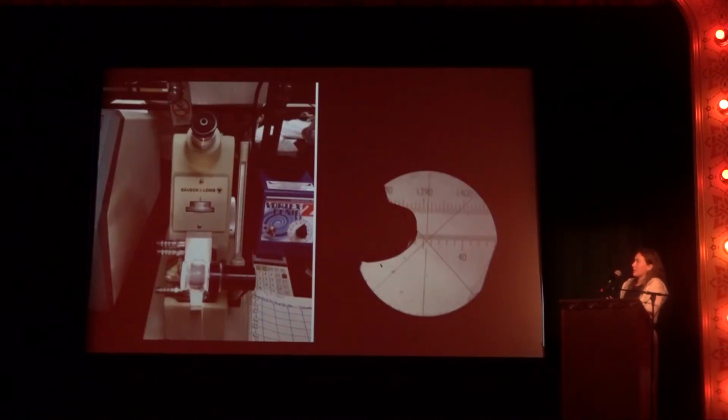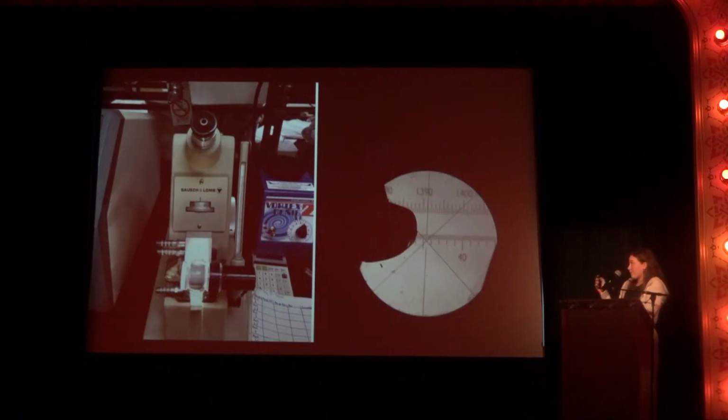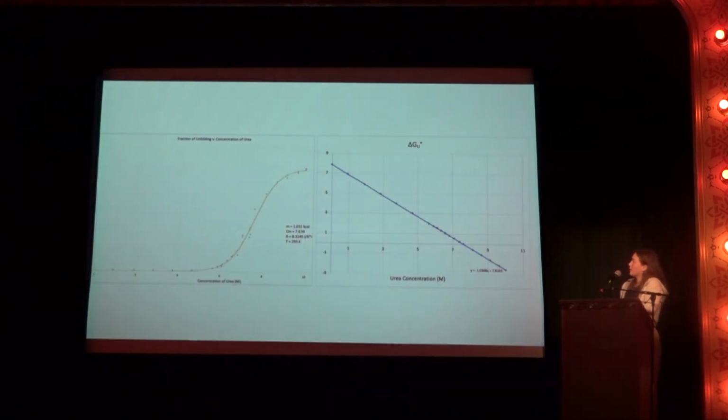So this is how I was measuring the cytochrome C. I used a refractometer, and so this is what I was looking into, and that's what it looked like on the outside. I spent like 2 days straight looking into this thing, and it really hurt my eyes, but it was so worth it because of just figuring out how the refractometer worked and just learning more about the protein, which was really cool. And then this was to use to determine the concentration. And so that was really cool, a different method than using the UV absorption machine.